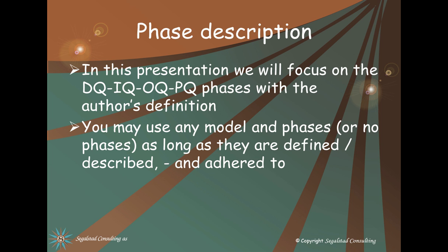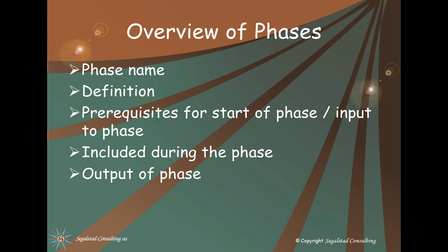In this presentation, I want to focus on the DQ, IQ, OQ, PQ phases, and that is because these are the most well-known terminology that we use. You may, of course, use any model or any type of phases or even no phases, as long as they're defined and described and adhered to.